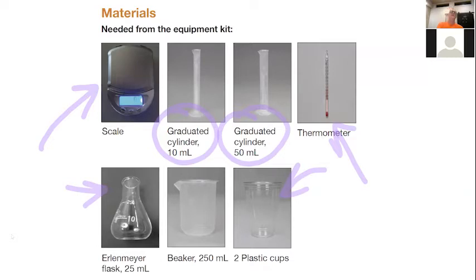We need to know what the density of the water is. So why is the density going to help us in this particular experiment? You're absolutely right. Well, how's that going to help us? What's that going to do for us? Since we're getting the mass, and then we have the density, we can get the volume. Genius. Yes, exactly.